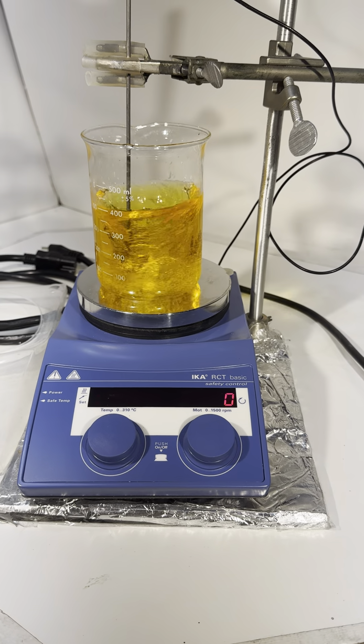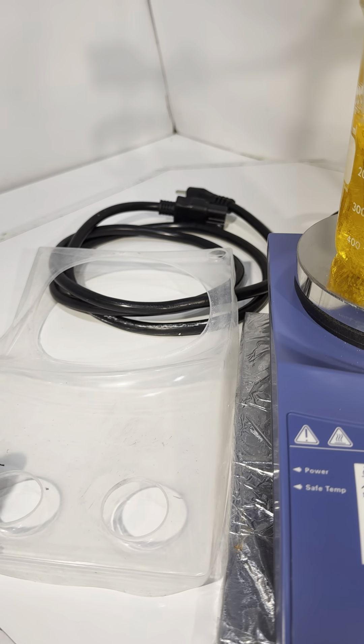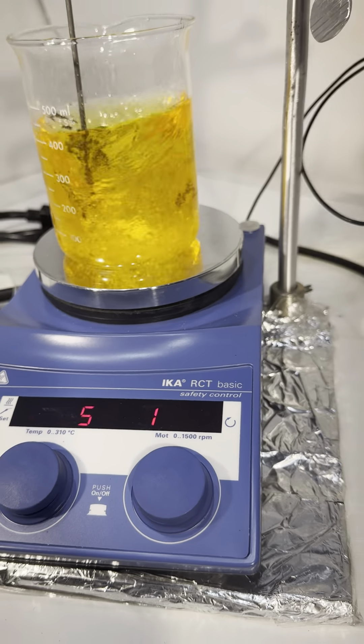It's infiltrated these off. It comes with silicone rubber and it's almost brand new.